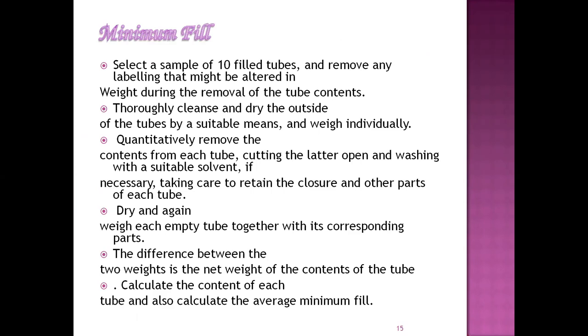So then next, let us talk about the minimum fill. In this case, we have to select a sample of 10 filled tubes and remove any labeling that might be altered in the weight during the removal of the tube contents. So thoroughly clean and dry the outside of the tubes by suitable means and then weigh each individually.